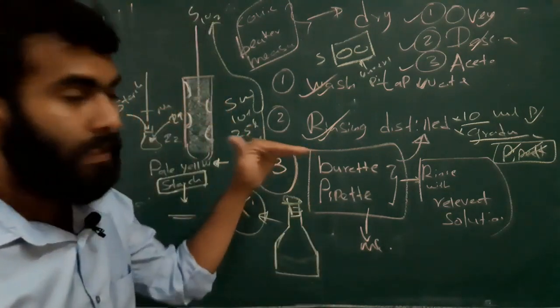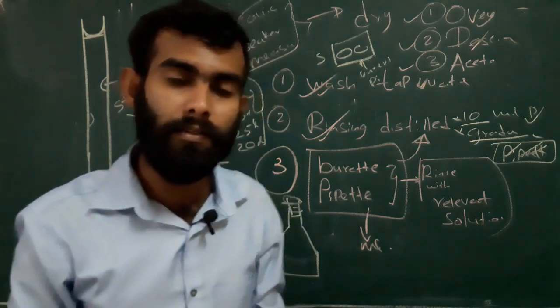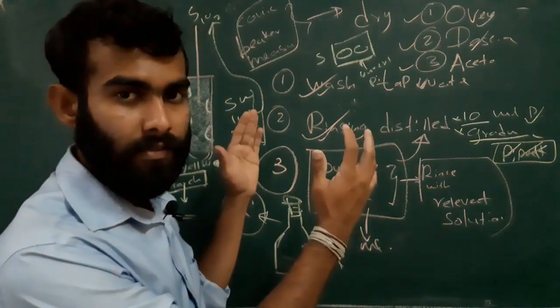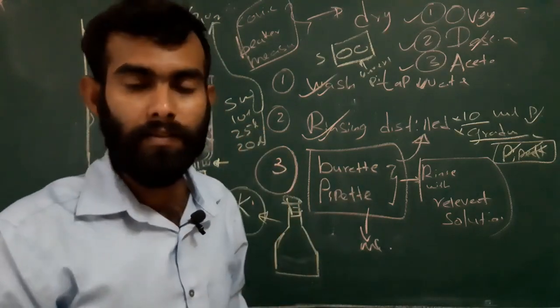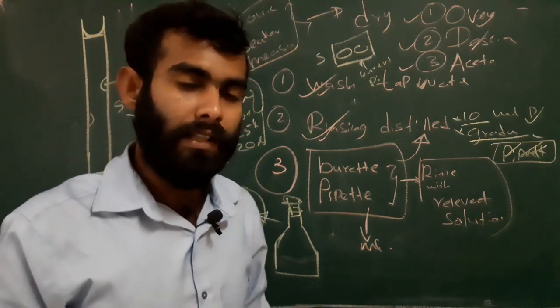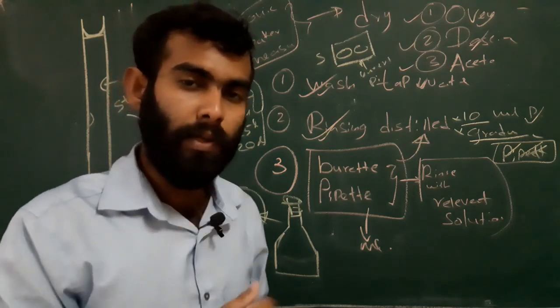So after 5 minutes, 10 minutes, 15 minutes and 20 minutes likewise, you can get the concentration of iodine. You can plot a graph of iodine concentration with time. You will get the particular graph for a zeroth order reaction. So that's the thing, you can do that. So that's the summary of experiment number 1. We will move to the second experiment.